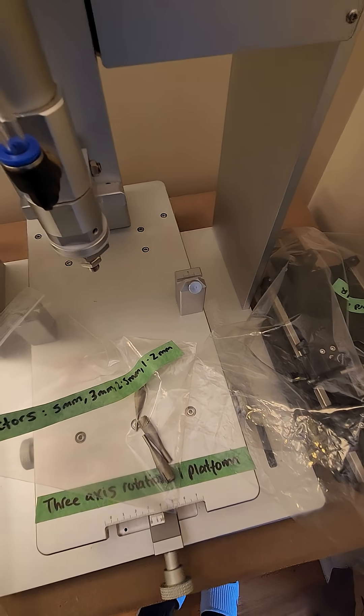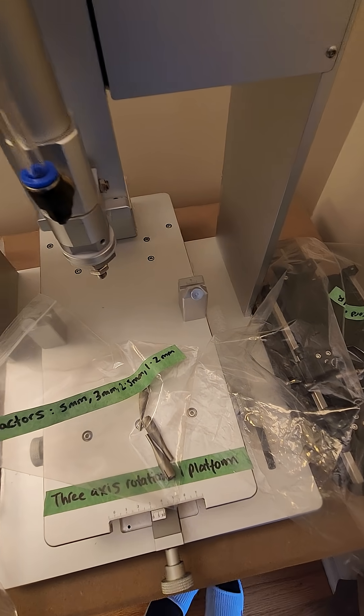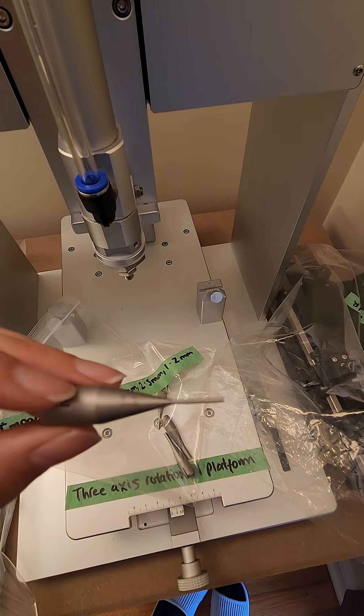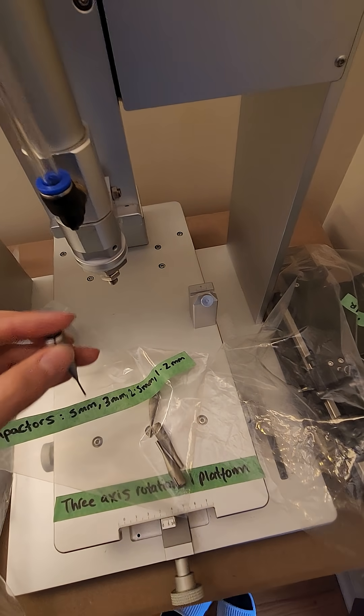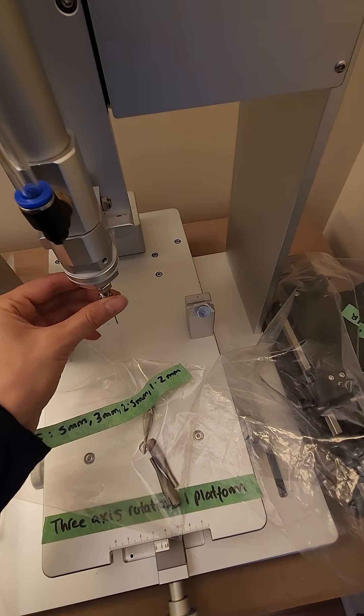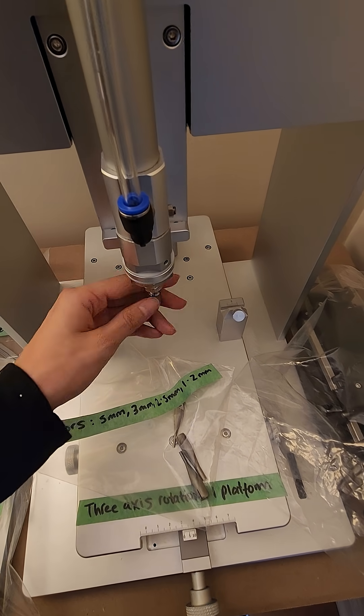Then you simply screw this into the impactor head anti-clockwise like that.